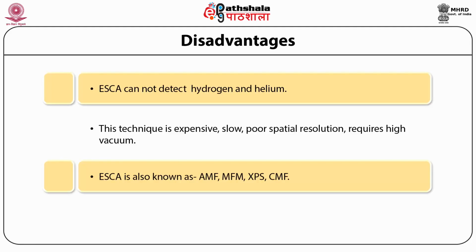Once this technique is carried out and we carry out the analysis, the surface gets destroyed, the layer gets changed, and therefore this surface cannot be used again for any other kind of analysis.